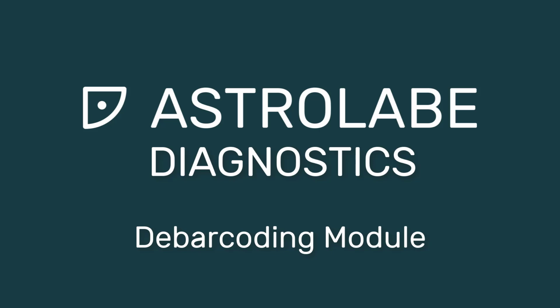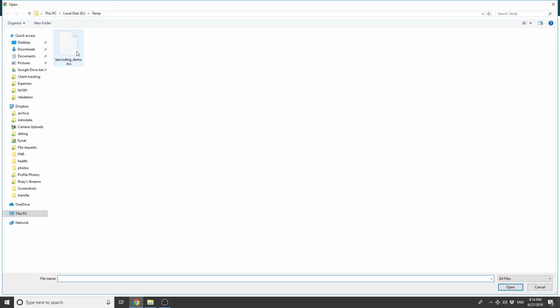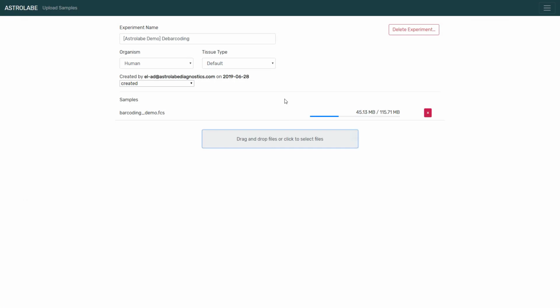Welcome to the Astrolabe Debarcoding video, where I will show you how to use Astrolabe's Debarcoding module. After creating an experiment, I'm going to start by uploading a barcoded FCS file.